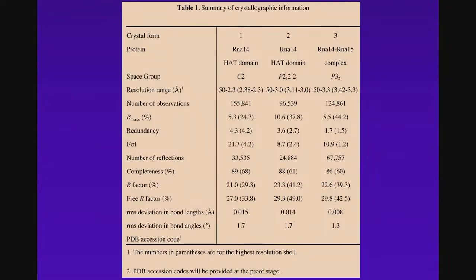In most structural biology papers, there is something called Table 1. By chance, that's the first table we show, because that's the table of statistics from either crystallography or cryo-EM. It gives statistics on our data quality or our model quality. So this is sort of the way you tell. Here is a table. It has 3 structures, and each row has unique information. This row tells you which protein is in that crystal.